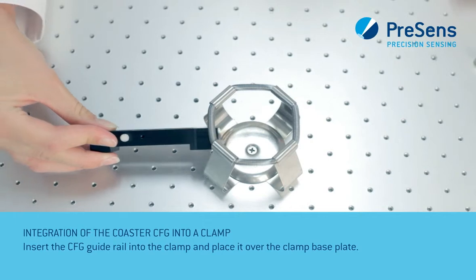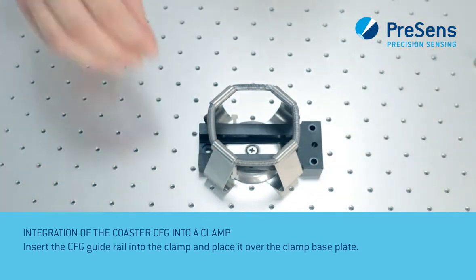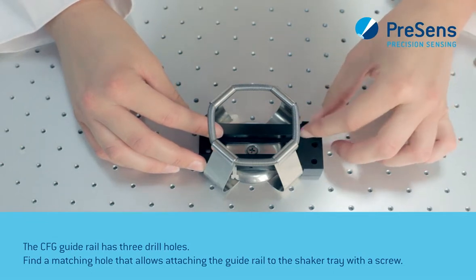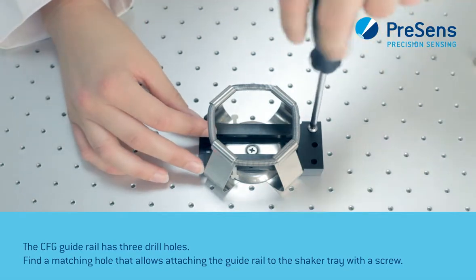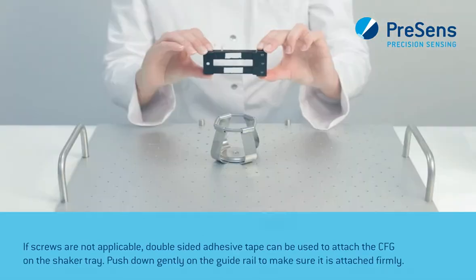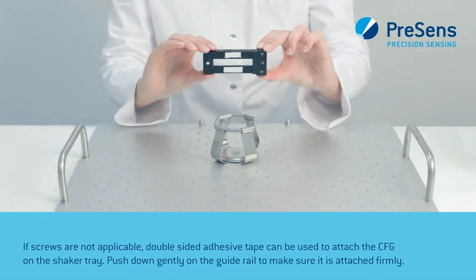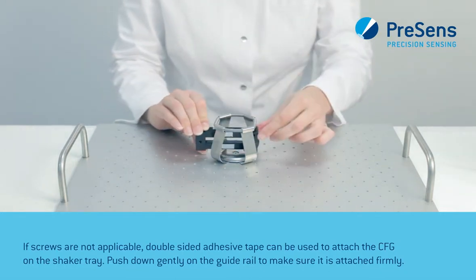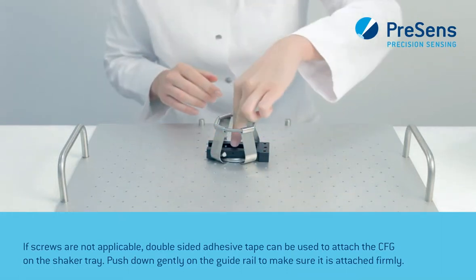Insert the CFG guide rail into the clamp and place it over the clamp base plate. The CFG guide rail has three drill holes. Find a matching hole that allows attaching the guide rail to the shaker tray with a screw. The screw has to be tightened so the guide rail is secured firmly to the shaker tray. If screws are not applicable, double-sided adhesive tape can be used to attach the CFG to the shaker tray. Push down gently on the guide rail to make sure it is attached firmly.